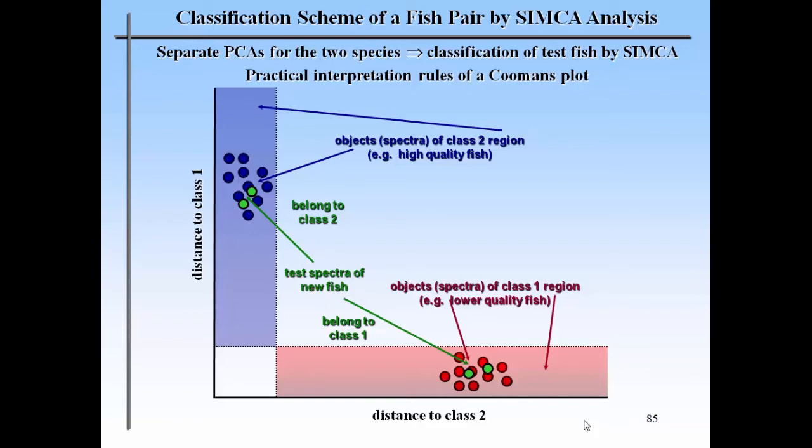But I can tell you one thing, the information is in the skin of the fish because we measured the skin. My wife filleted it, and we measured also the meat. The discrimination via the meat is much more difficult or almost impossible compared to the skin. So the information is obviously in the skin.